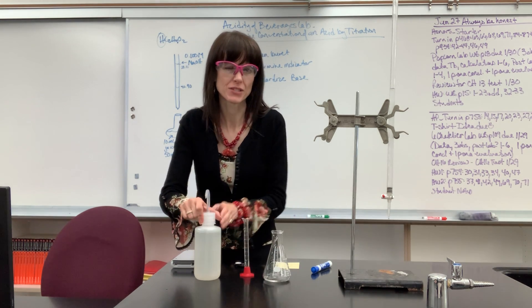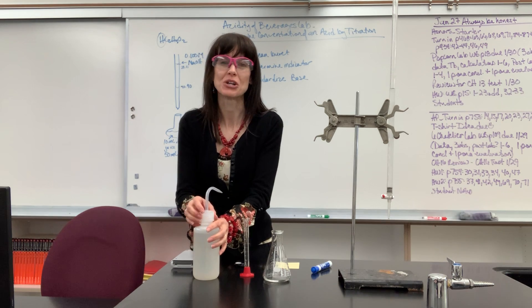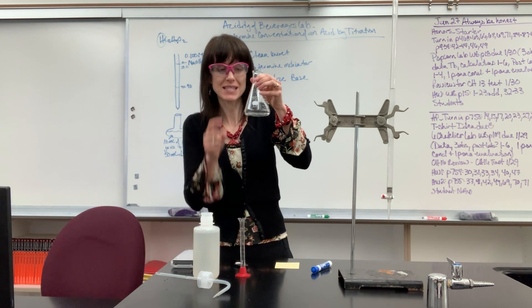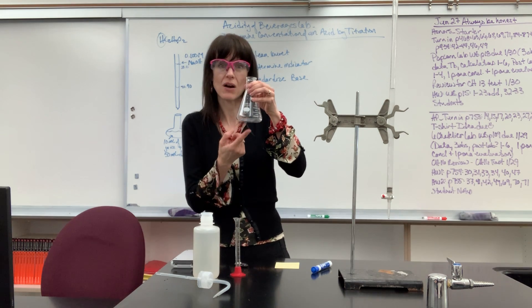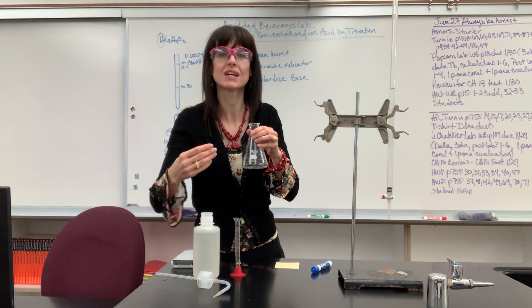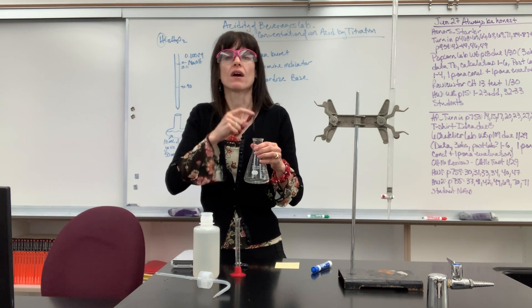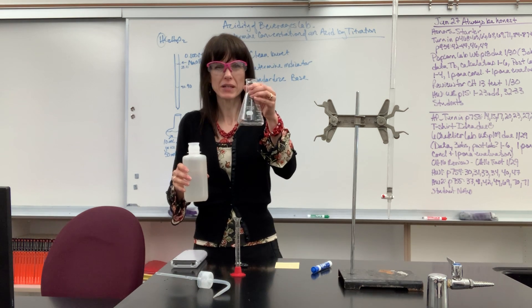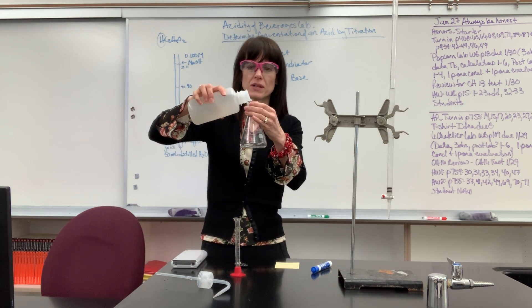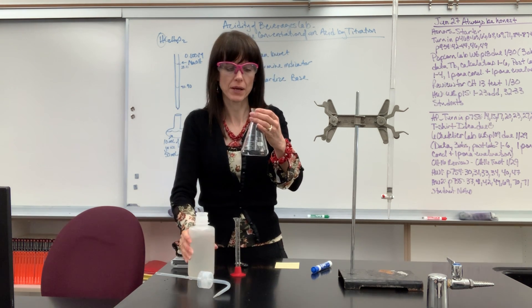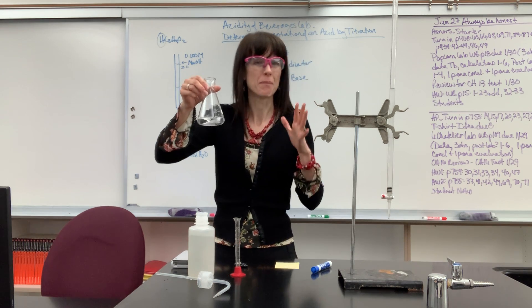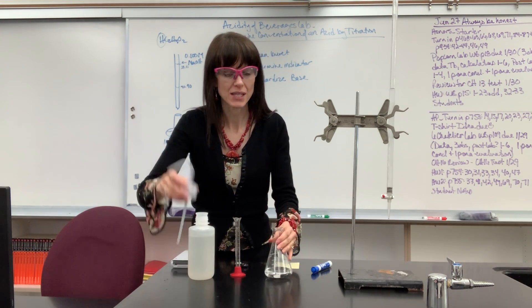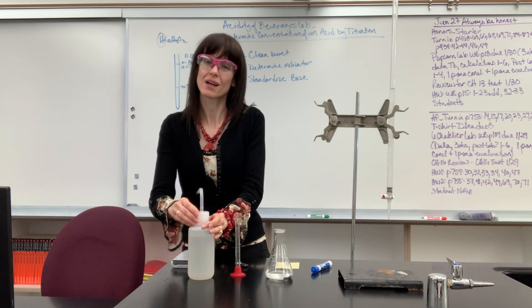You just added 10 mils and added extra water to it. Now, by adding water to it, I changed the concentration, but do you know what? For a titration, I don't care. All I care about is the number of moles of acid. I put 10 mils of the pineapple juice, and there's a fixed amount of acid. By adding distilled water, I didn't change the moles of the acid. The moles of the acid stay the same. The concentration changed, but the moles of the acid stay the same, and what I'm interested in is determining the moles of acid inside of here. So to make this a little bit easier to do the titration, I have my students add 50 to 100 mils. It just helps you see the phenolphthalein change a little bit better.